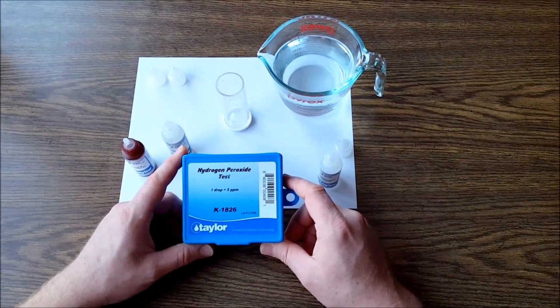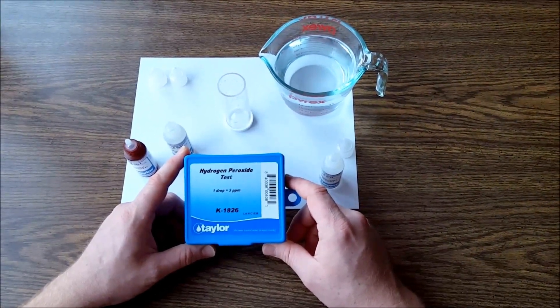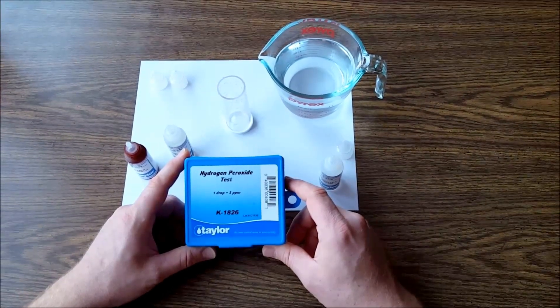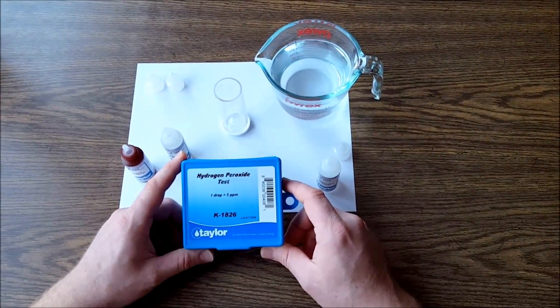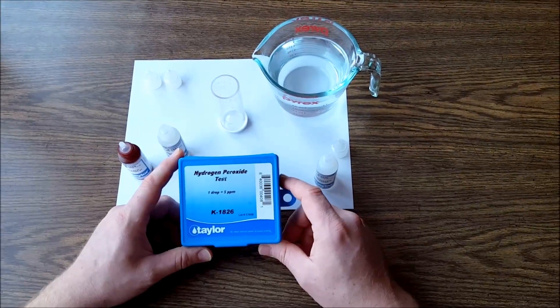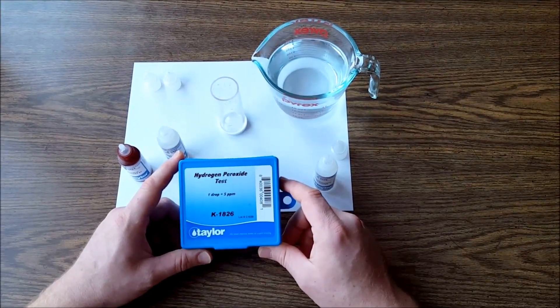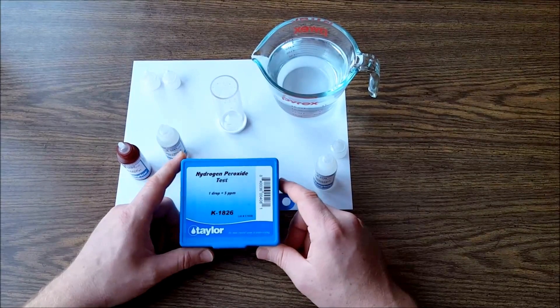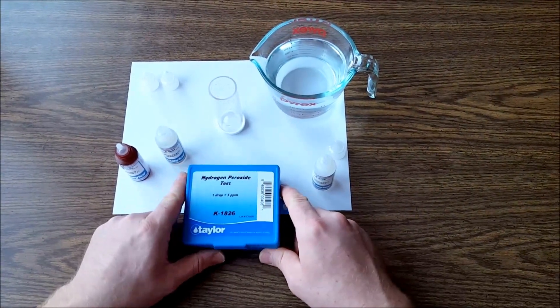There's two versions: there's the k1826 which is the 0.75 ounce, and then there's the k1825 which is the two ounce version. The difference is the k1826 will give you 44 results and the k1825 will give you 118 test results. And it's fairly simple.